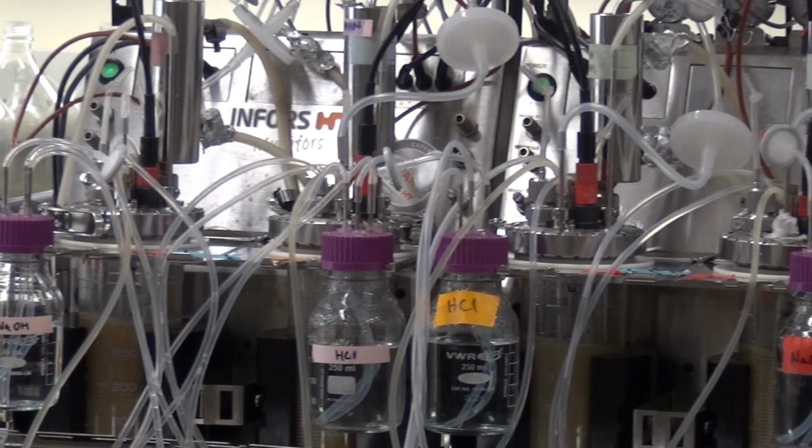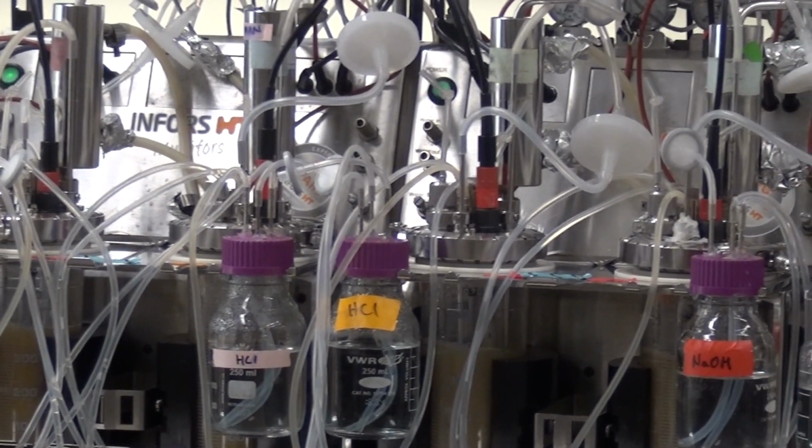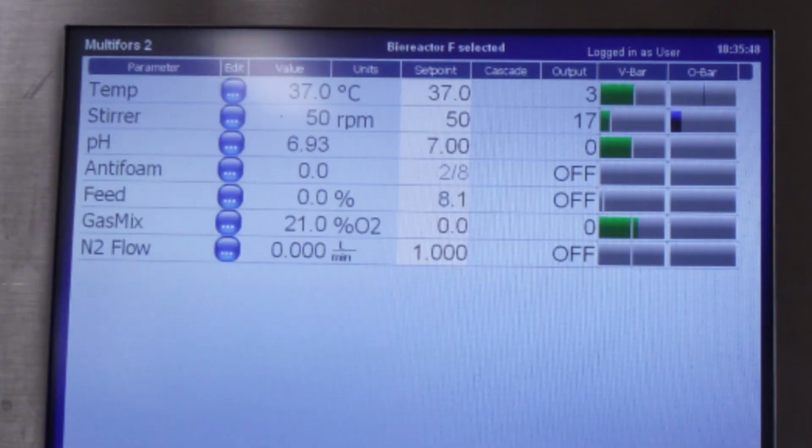So the microbes that live in the gut have a very unique environment in which they live, which all we've done behind me, a sort of complicated apparatus of stainless steel and tubing, is to mimic. And so how do we do that? Well, there are several key things which are really important in that environment. There's the temperature, there's the pH, and there is, of course, the food that we feed these microbes. And also, very importantly, there is a requirement for a lack of oxygen.